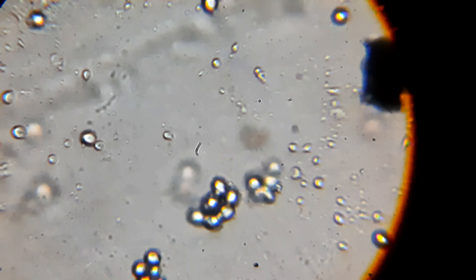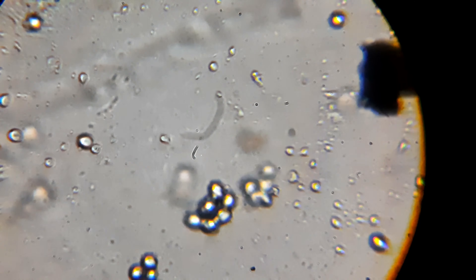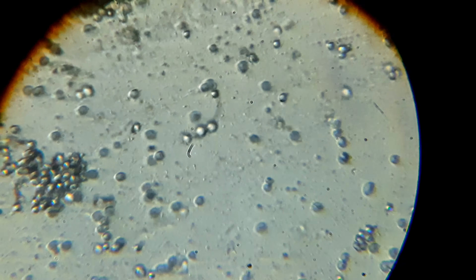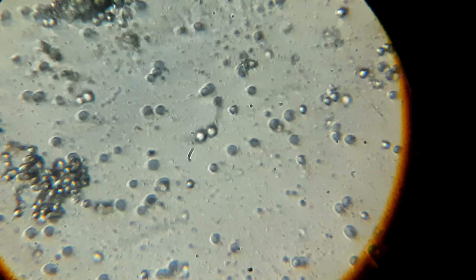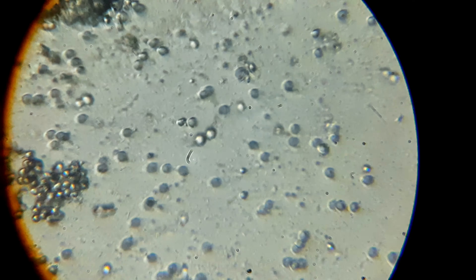This is a different view where I got a little more contrast — I just adjusted it to a different contrast setting to get a better view. This is at 450 times magnification, where you must be able to view more spores in a single area.